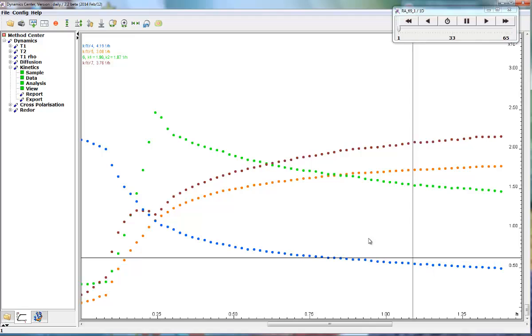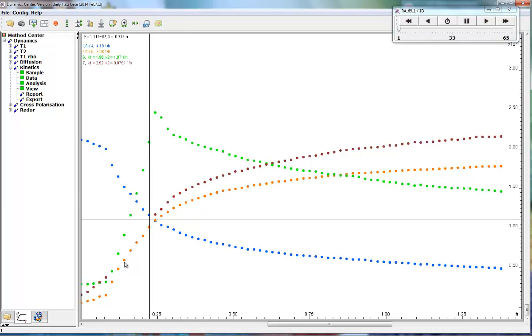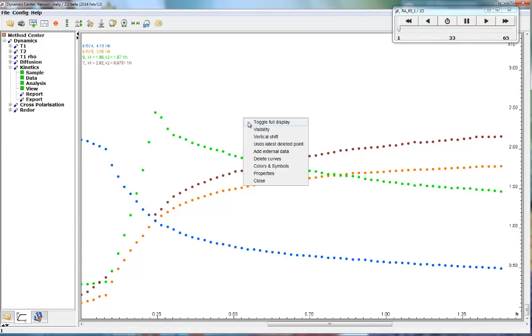Due to overlapping, some points in Profile 7 are off. Right-click on one of them and choose Delete Point to delete one point, or Delete Points in Range to delete several at the same time. The curve fitting will be automatically recalculated. At this point, we are ready for reporting.